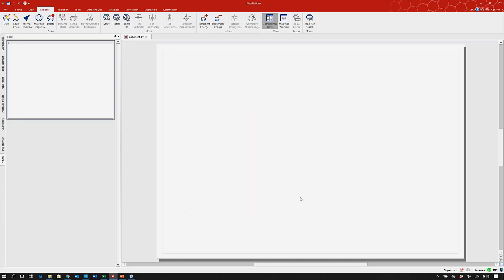Now, if you have made changes, the software may ask you to close Mnova and reopen it again. So please do so. I will just give you a few seconds so that you have time to close the software and open it again.